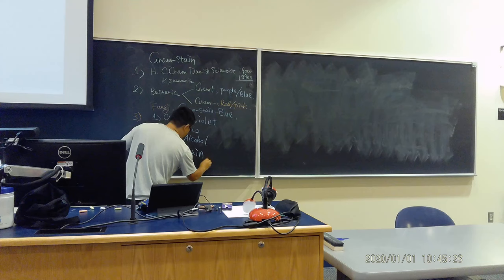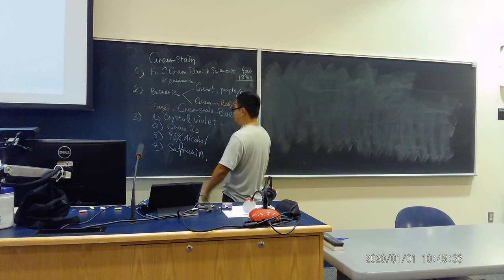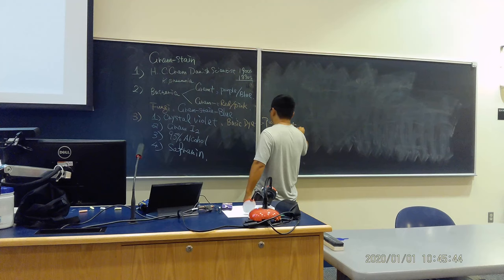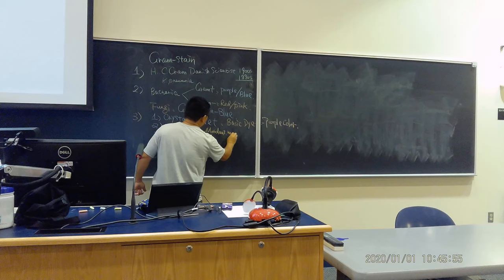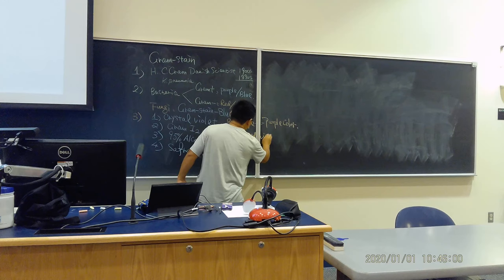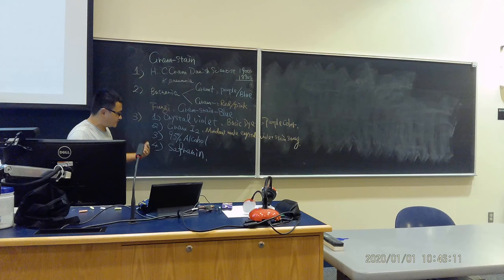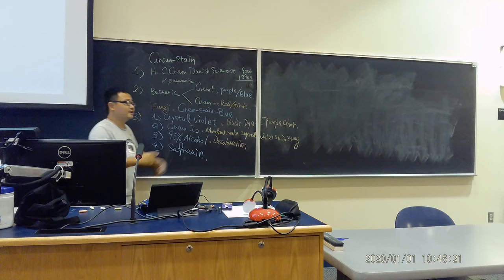Now, what are the functions of these four procedures? Number one, crystal violet. This is a basic dye, I will say. You're going to put the color there, so you put purple color. What's the function of Gram's iodine? The function of Gram's iodine, we call it a mordant, which makes crystal violet stay strong. Okay, what is the third step, 95% alcohol? This is what we call decolorization. We try to remove those two. Hopefully it's like blank, nothing there. So what's the last step of safranin? Counterstain.